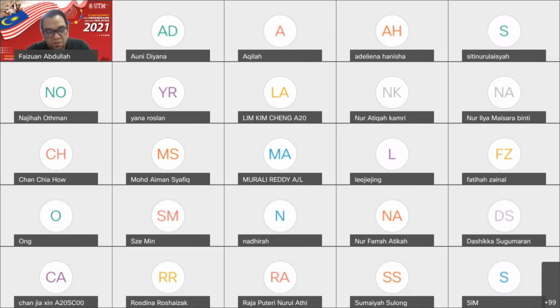We record all the weight of the precipitates, with the crucible before and after, and then we calculate how much is the precipitates. After that we can determine how much is the metal that already reacted with our precipitant. That is a classical method.